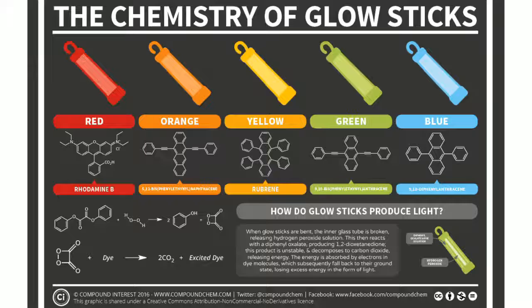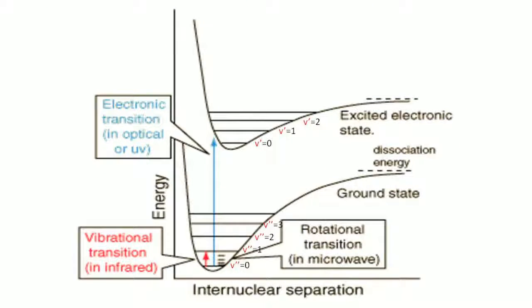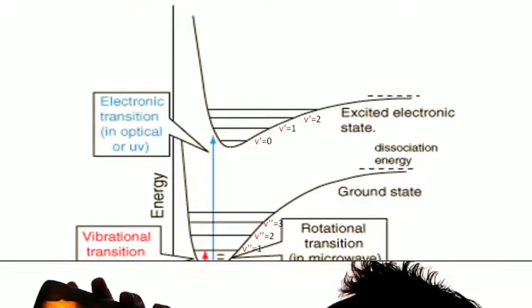It should be noted that not all of these energy level transitions are of a high enough energy difference to produce a photon in the visible spectrum, and that energy is instead released as heat or vibrationally. Emission intensity also depends on the properties of energy input, because depending on the type of energy input, molecules can be excited vibrationally, rotationally, or electronically, like how infrared radiation can excite molecules into vibrational states.